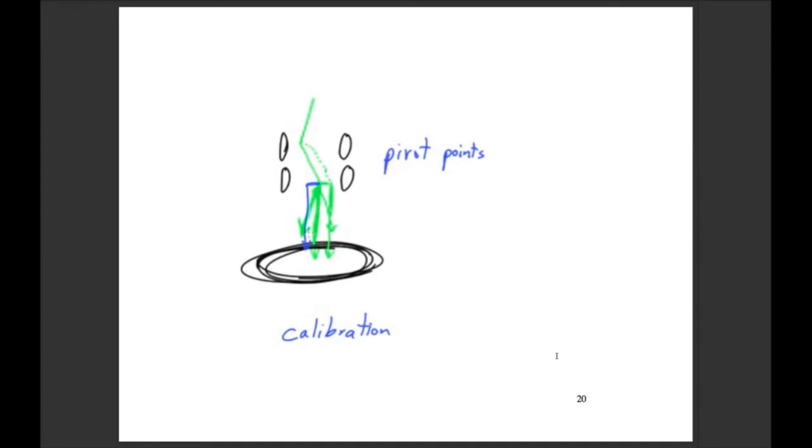So calibration, he talks about a calibration versus an alignment. I think as scientists, you guys kind of know what a calibration is. It's something internal in the system that you want to make sure is correct before you do any external alignments to that set standard.